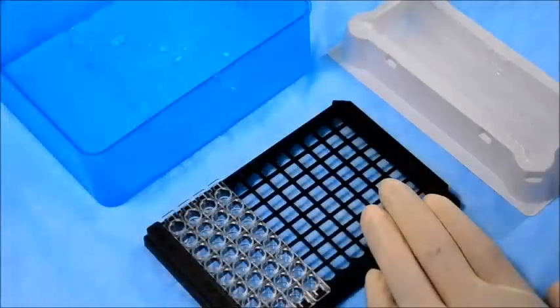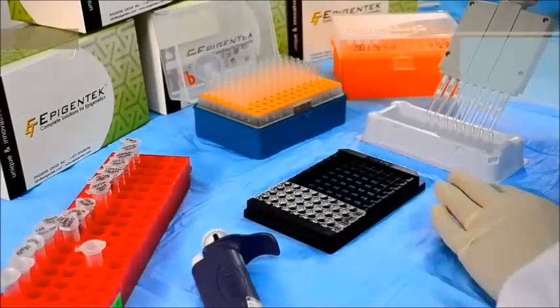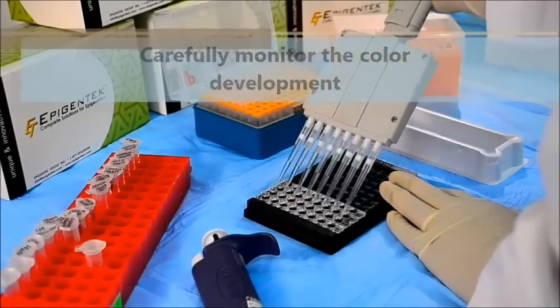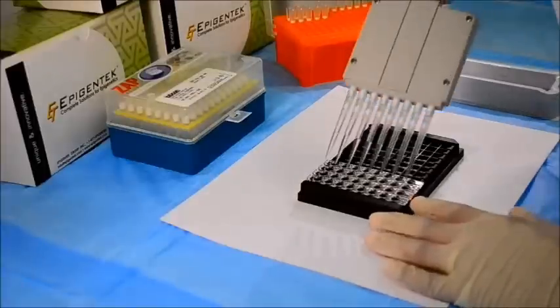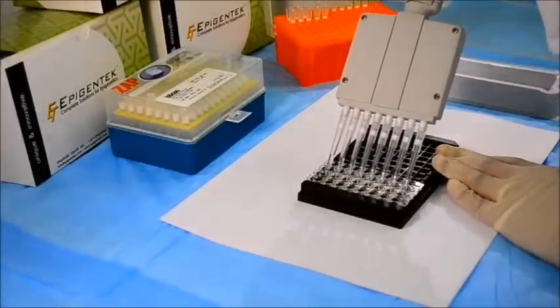Then wash the wells again. Add the developer solution to each well, followed by incubation at room temperature. Wells that contain sufficient amounts of methylated DNA will turn blue. Add the stop solution when the color in the wells turns medium blue and the color in the blank wells remains the same.